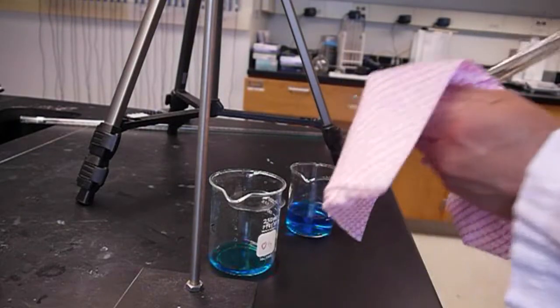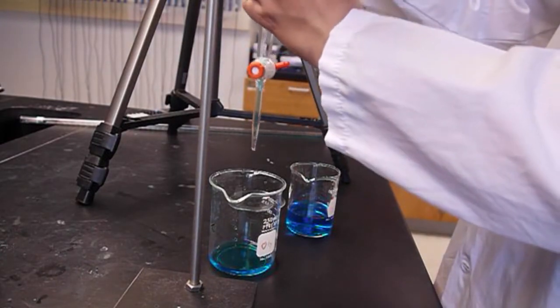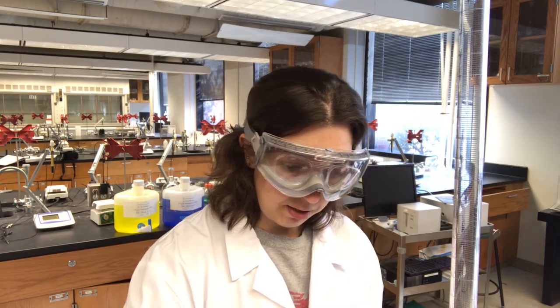I'm going to use my towel to make sure I don't get any solution on the outside of the Buret, and then put it back in the Buret stand. Right. Still have a little bit of solution in the tip, that's fine. You can empty that.